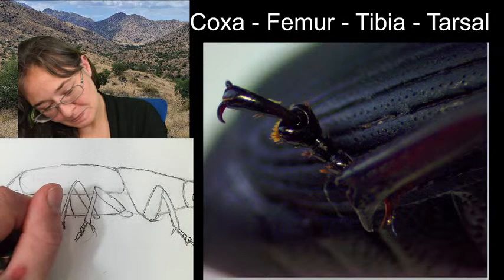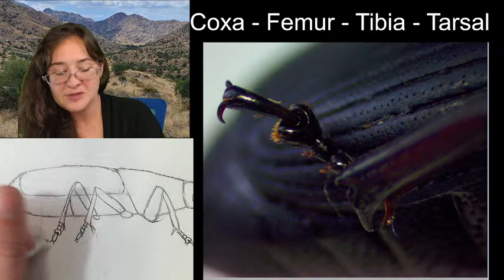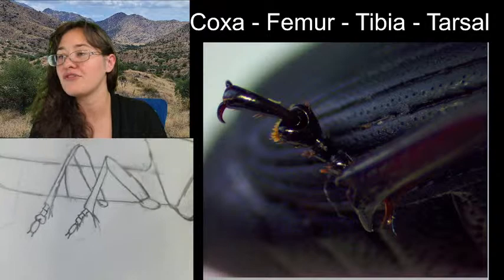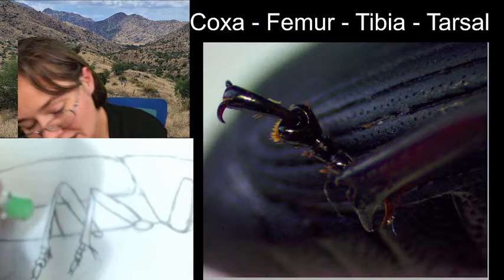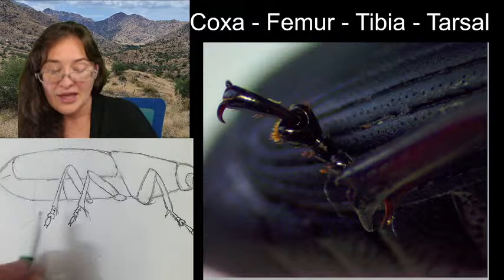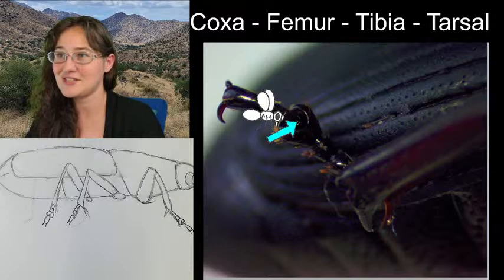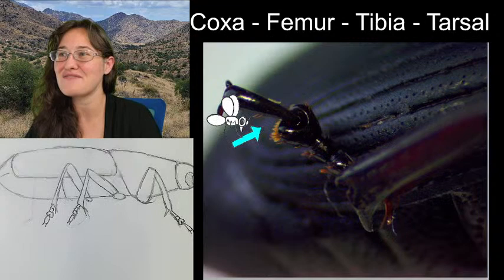So this is that cup-like segment, and it's funny because if you were ever identifying one of these beetles, it would say that its tarsal formula was apparently 444, but actually 555. That's because it looks like there are four tarsal segments on each. But if you look in between, at that third segment right about here, there's a little itty bitty microsegment that pretty much no one can see, so we don't count it. But it exists, so it's actually 555, even though it's apparently 444.